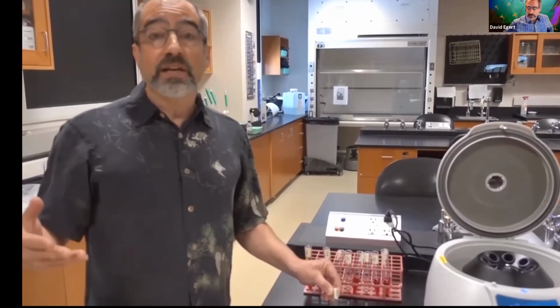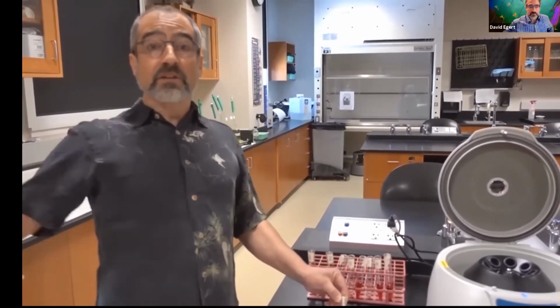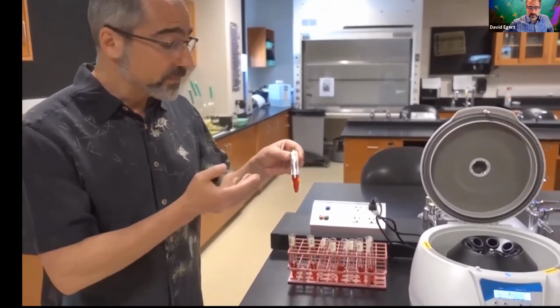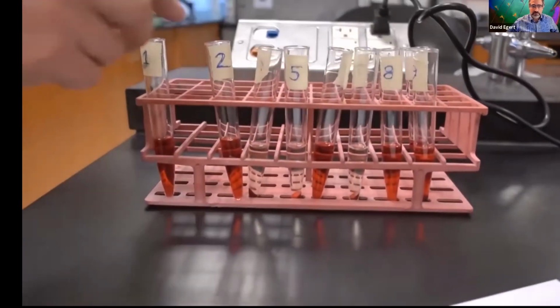Whereas the older cells are not able to sustain that kind of increased pressure and are more likely to explode and create this hemolysis condition. So, what you get in this tube might depend on just how old or how healthy the blood cells are.